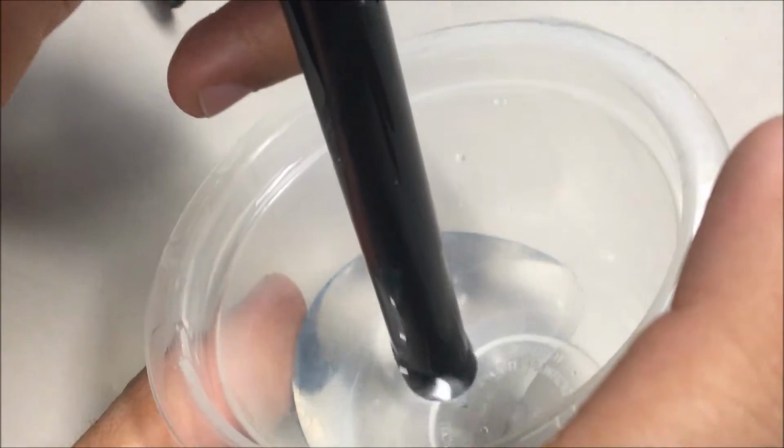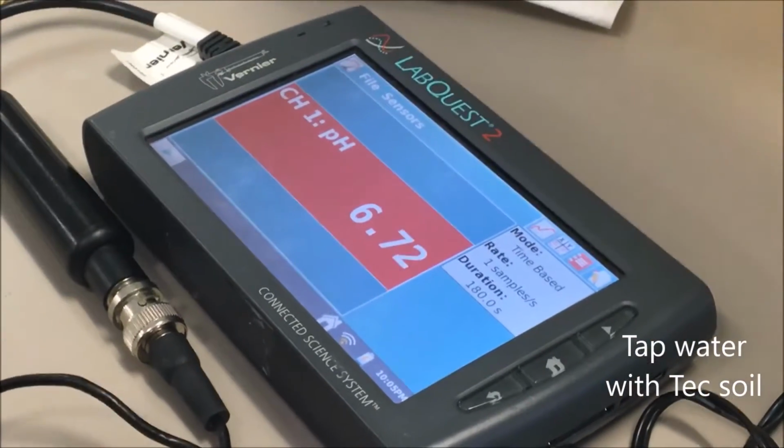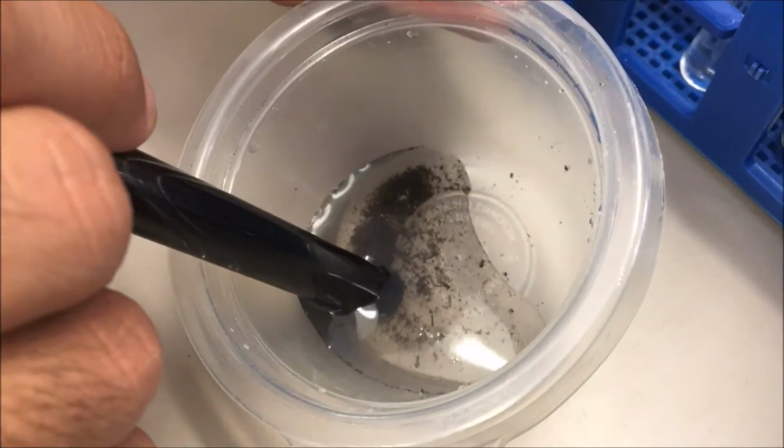The only safety measure needed is to clean the pH meter every time you use it, and also to wear a lab coat to avoid any stains on the clothes.